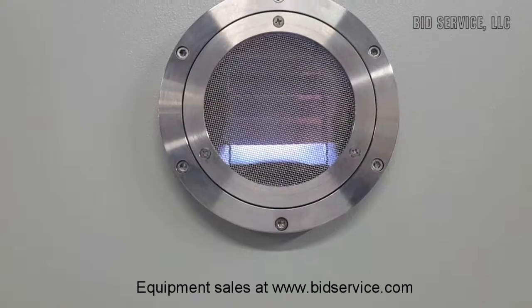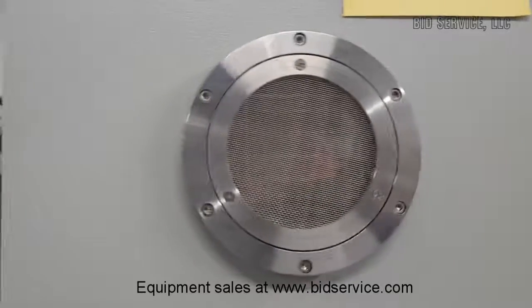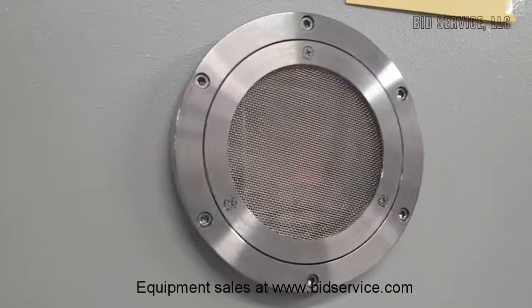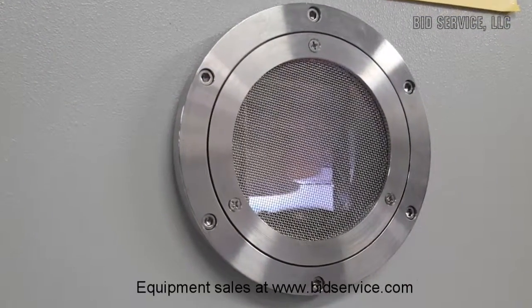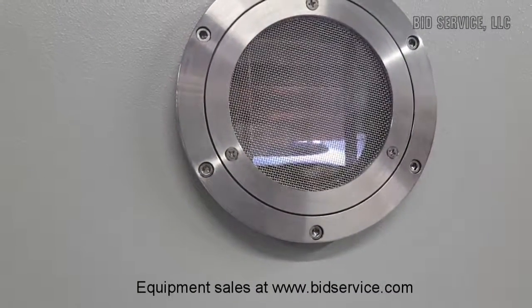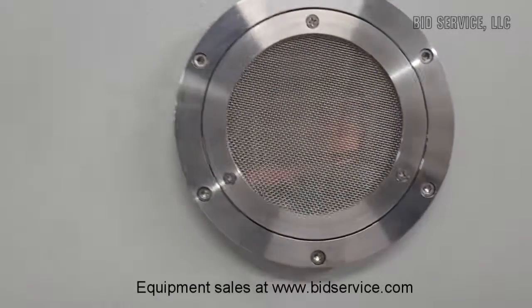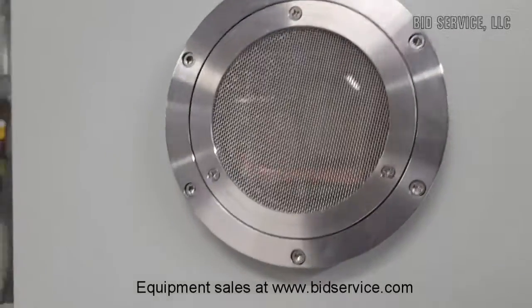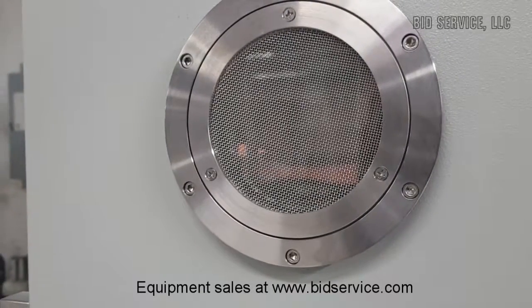Now, just keep the camera there — I'm going to change it over to target 2. And that's target 2. Now I'm going to do target 1. Target 1 is coming on.